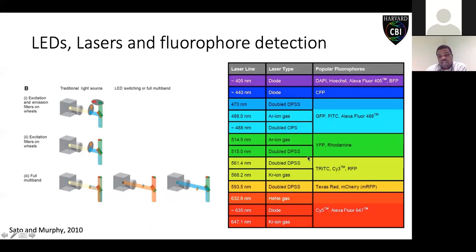In the standard traditional microscopy, most people have 4 dyes, where you think of your 405 for DAPI, then you have your GFP, which is in the 488 line, then your 561, which is in the red, and then your far red, which is the 630. These are the 4 standard, but there are techniques which I will discuss later of how to image when you have things that are in between these various laser lines, or you have fluorophores that overlap in terms of their emission wavelength.